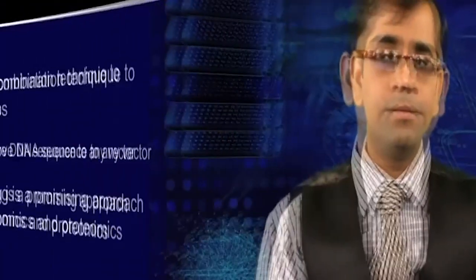In our discussion on recombinational cloning, I will focus more on the recombinational cloning system from Gateway, mostly because of my familiarity with using this system. However, any of these systems can be used for recombinational cloning, where the basic principle remains more or less the same.